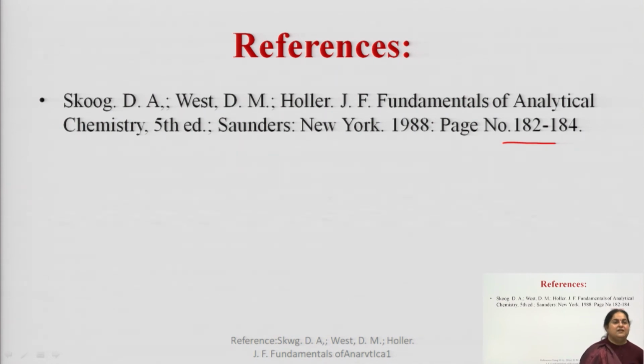So, these are actually the determination methods of pH. So, it is taken up in the analytical chemistry book. You can find this topic in an elaborative manner in the book, right. And to a little extent, only briefly, it is described in CVS Subramaniam, and I am not able to find this topic in any of the other books, right. This is only in Skoog and West, and you can search for articles if you want. Some articles are also there on this method.